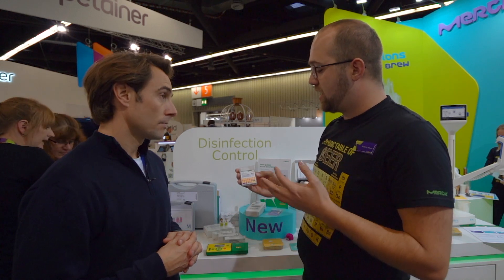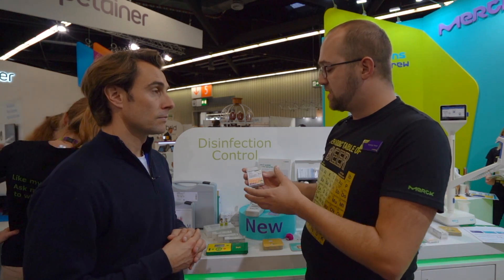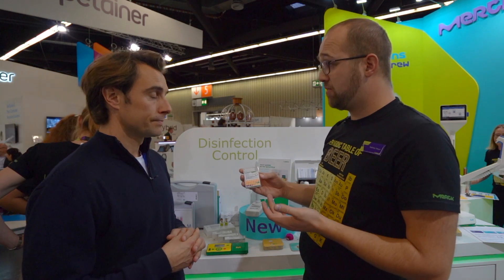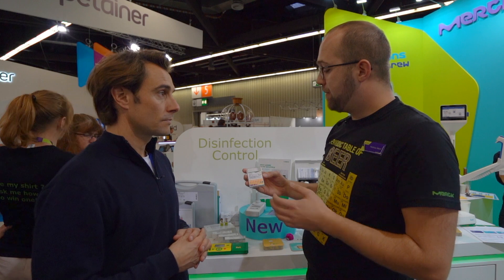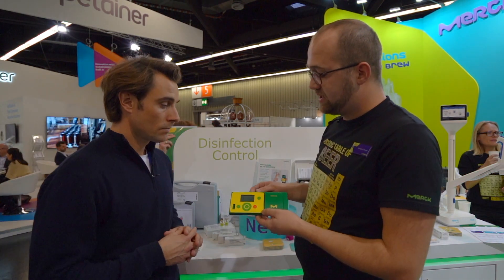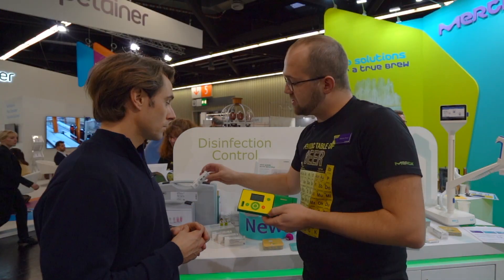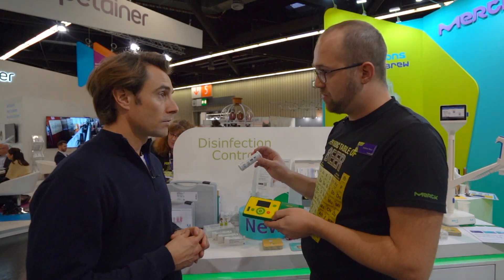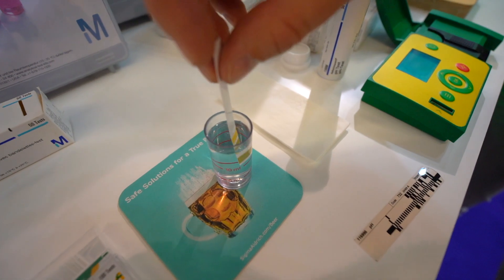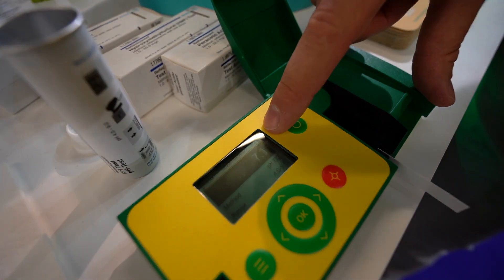Some lab managers say they want it a little bit more precise, but they want to stay on this technique — the test strip. It's easy per parameter, it's easy to do, it's cheap per measurement. And we have a technology to do that. If we combine this test strip with color measurements, the only thing you have to do is use slightly different test strips — they are a little bit broader because of the accuracy. And then you put the test strip into the sample, put it in the instrument, and you get the result.